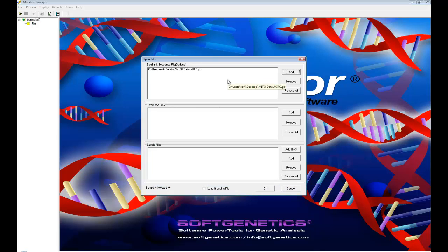Mutation Surveyor offers support for the mitochondrial amino acid translation by scanning the GenBank file for the appropriate translation table.